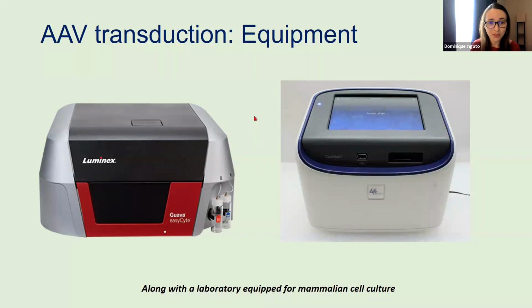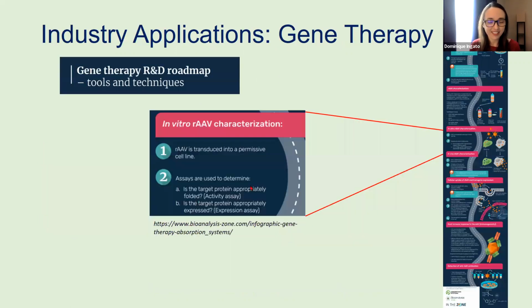If you don't have access to this equipment, there are always modifications. There's Labster with flow cytometry. There are ways that you can partner with other schools that may have this so that you can get data to show to the students. I would be happy to work with you on that if you don't have a flow cytometer available. So let's go ahead and continue on, and I'll tell you a little bit about the experiment. We can click to the next slide, Maggie.